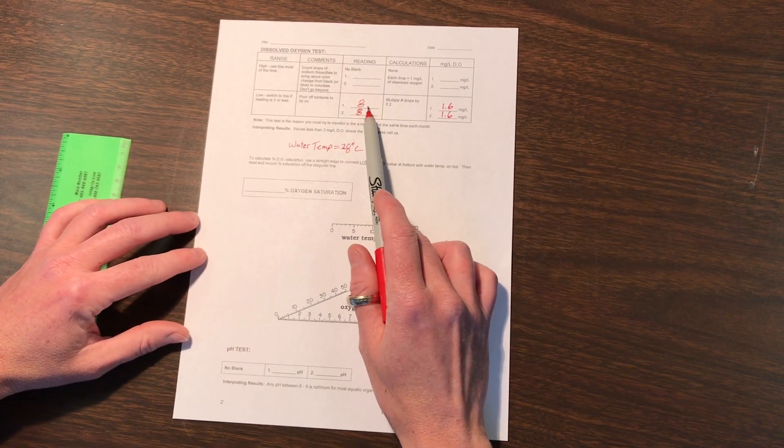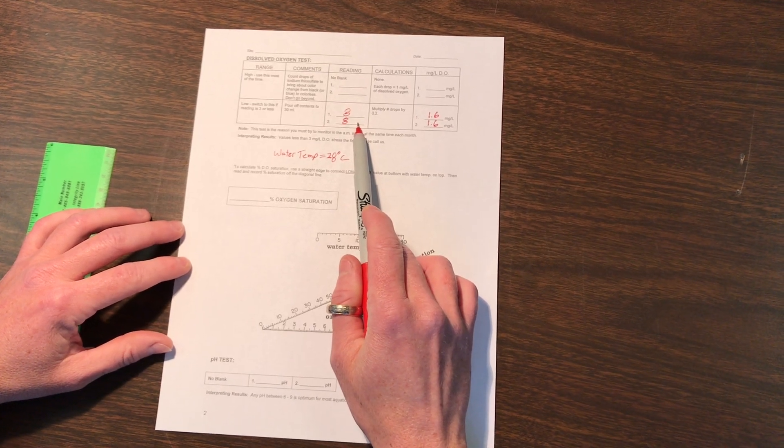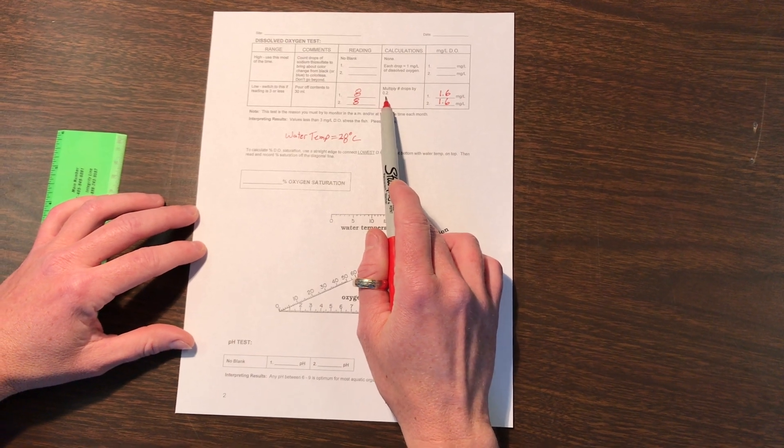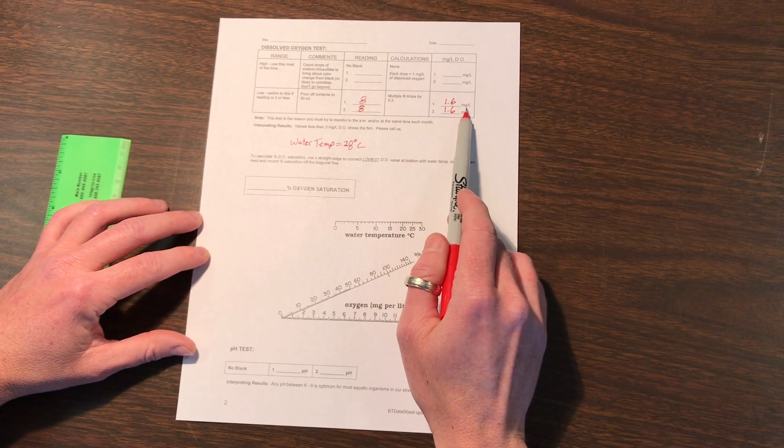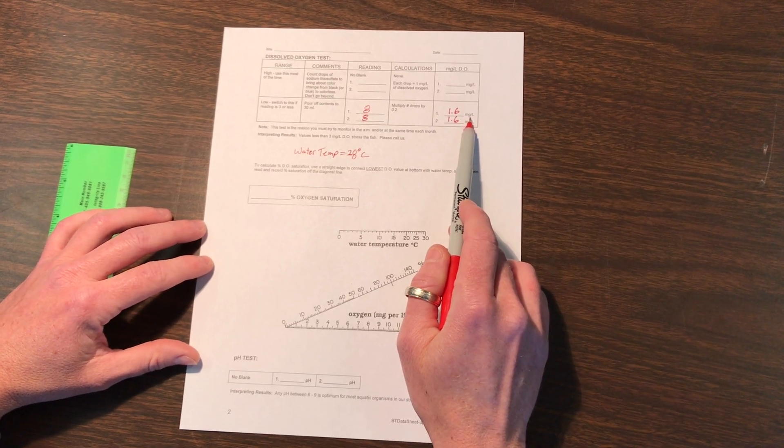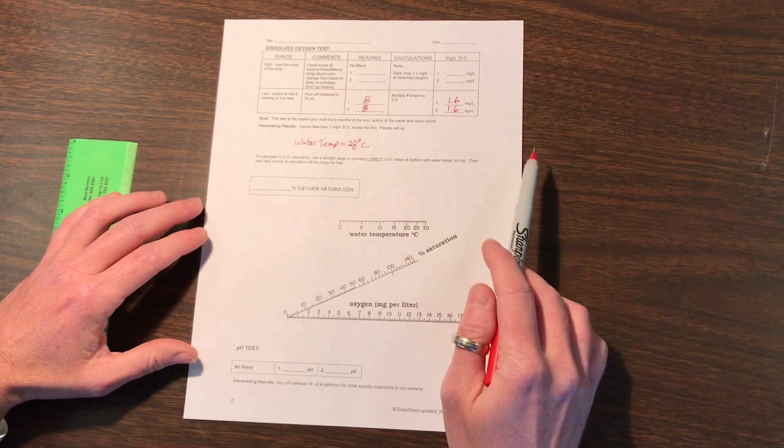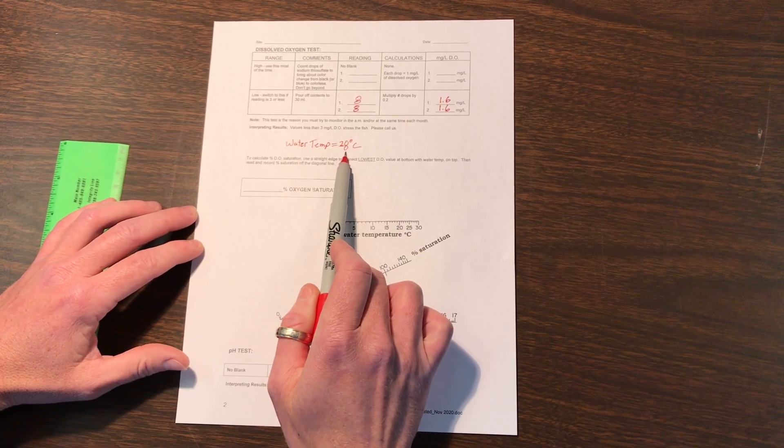We came up with 8 drops for both bottles, so that makes it easy. Multiplying each drop by 0.2, our calculated result is going to be 1.6 mg per liter of oxygen for this creek on this date. Our water temperature is 28 degrees Celsius, so pretty warm.